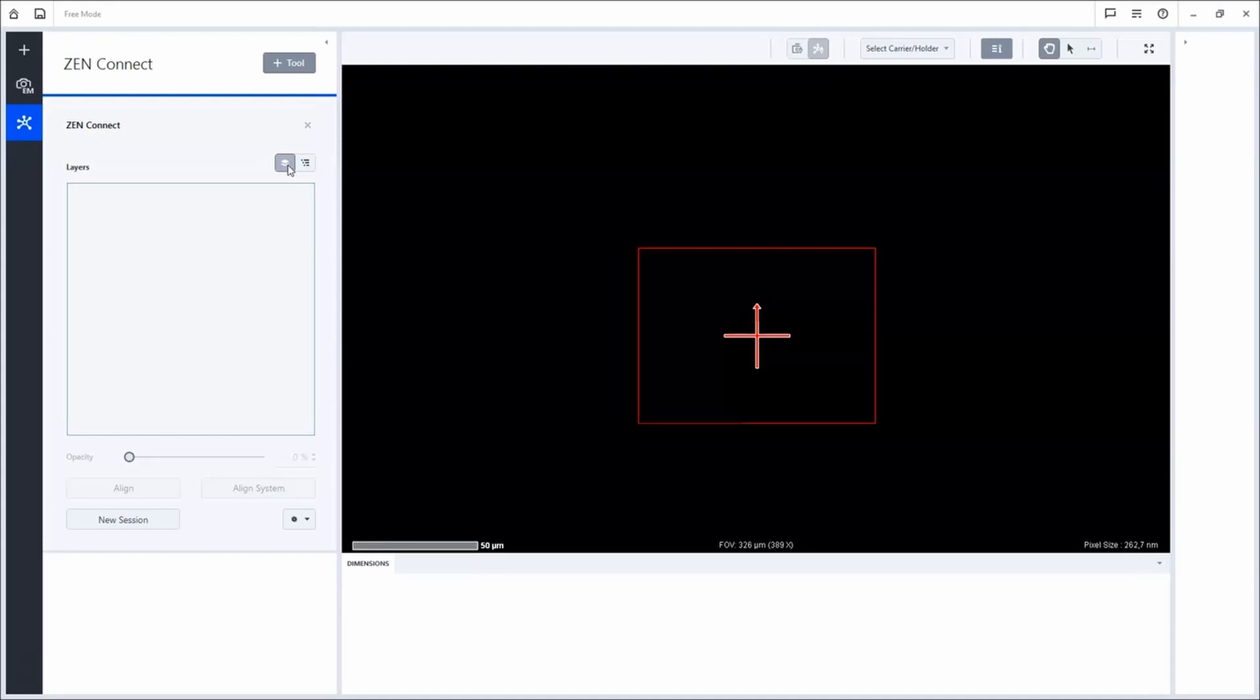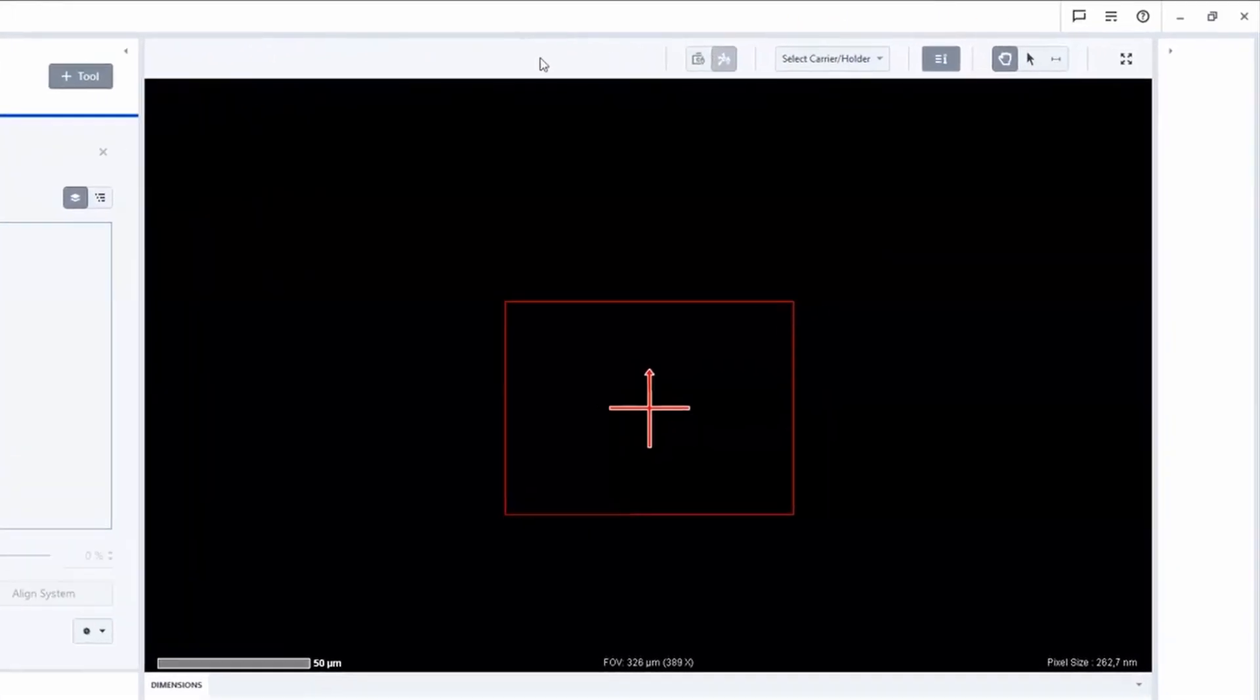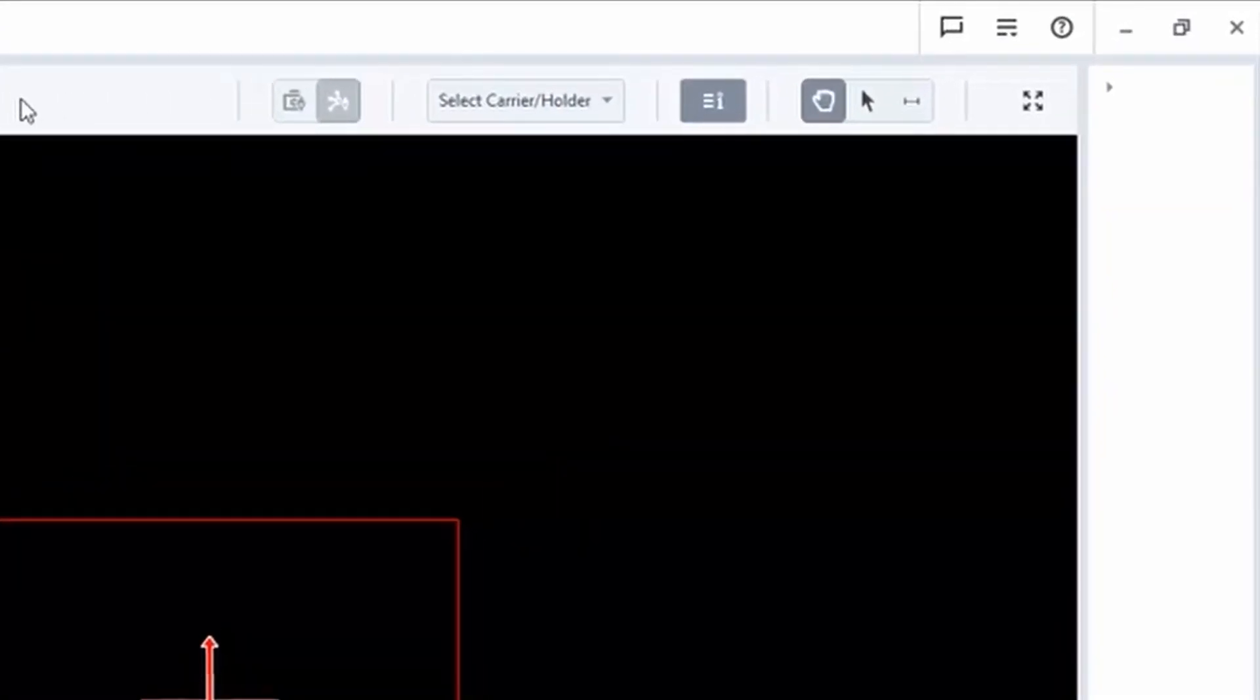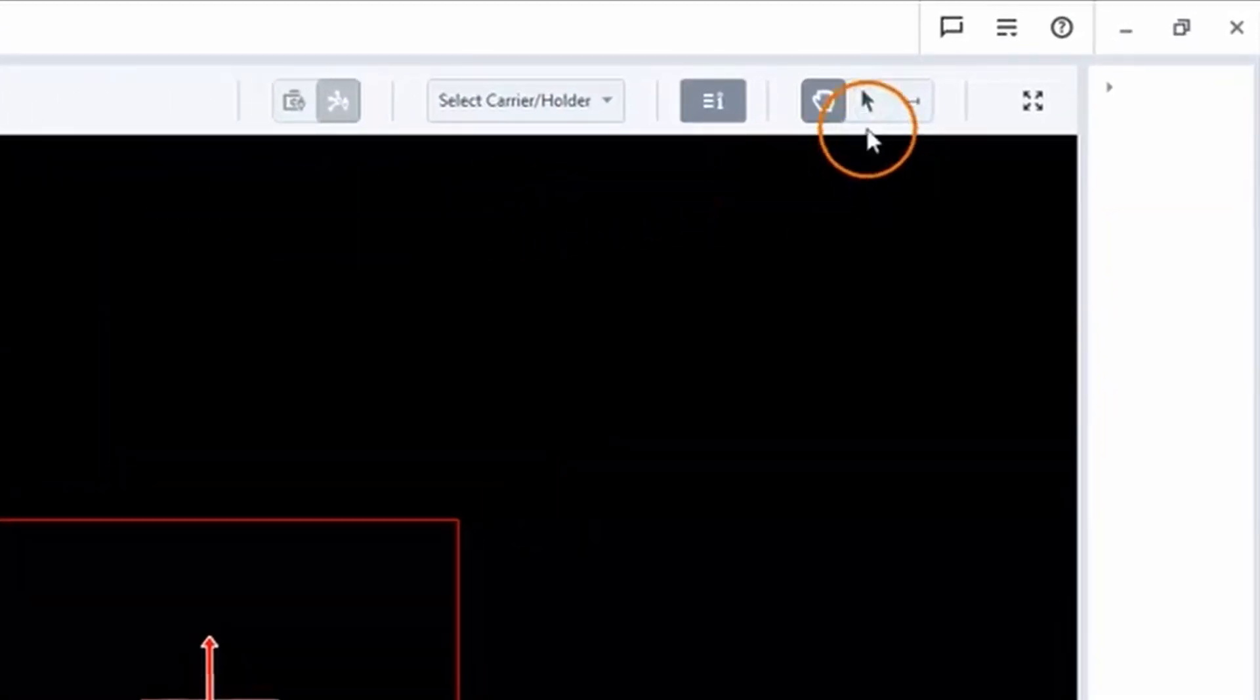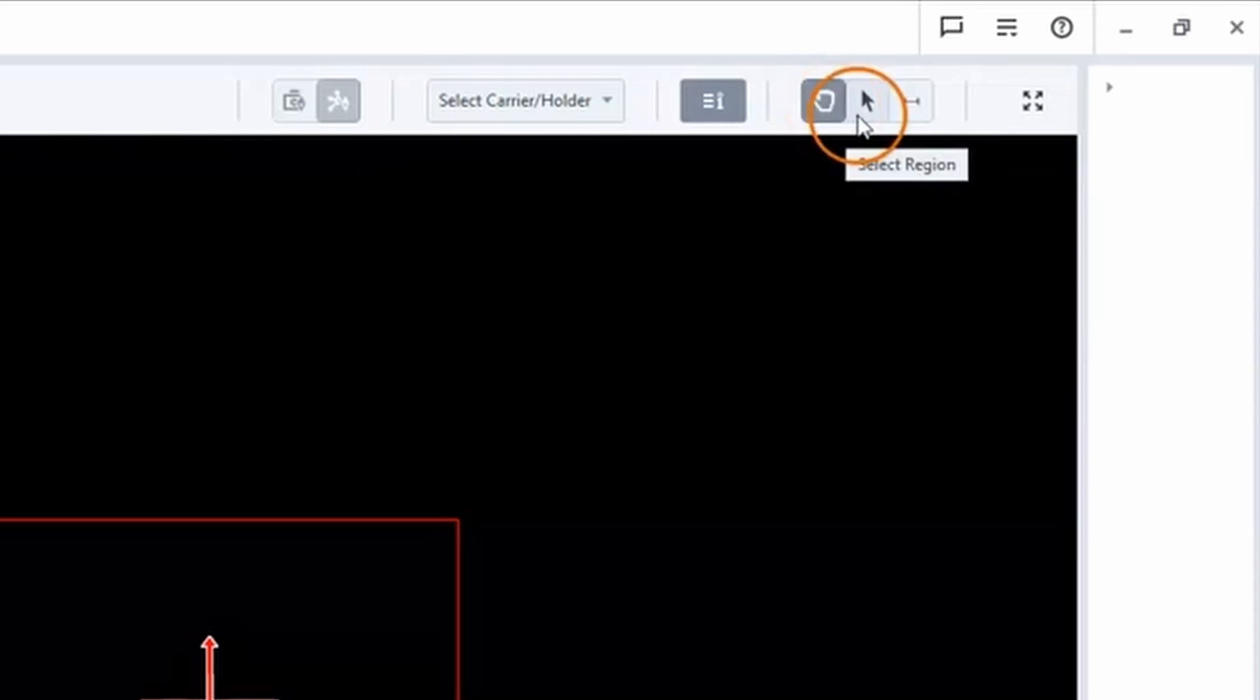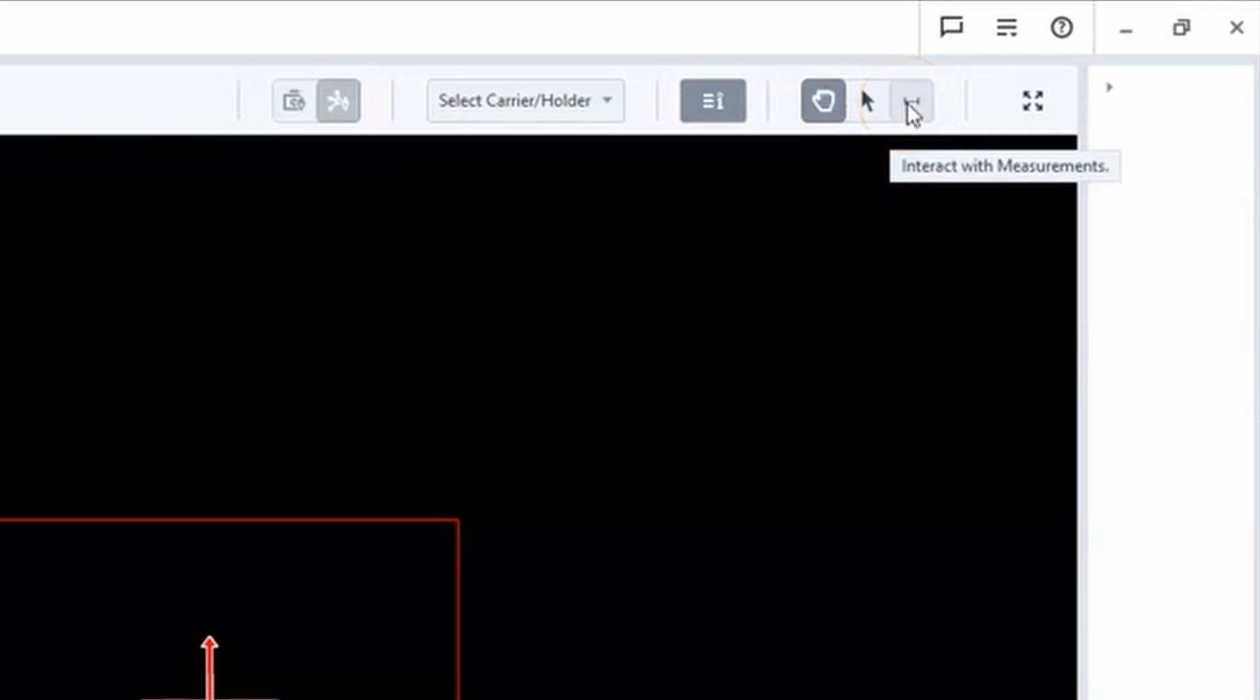On the top of the correlative workspace, there is a small toolset that helps you to navigate, pan, align and measure inside the correlative workspace.